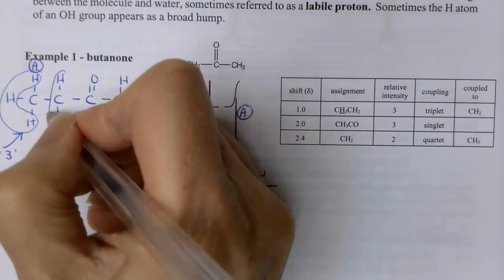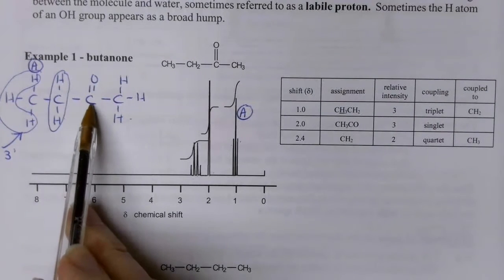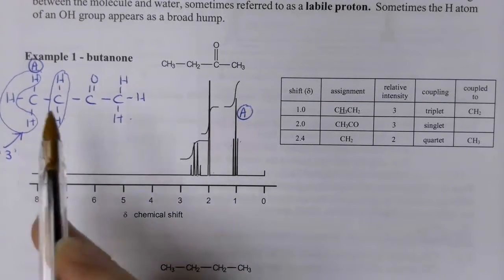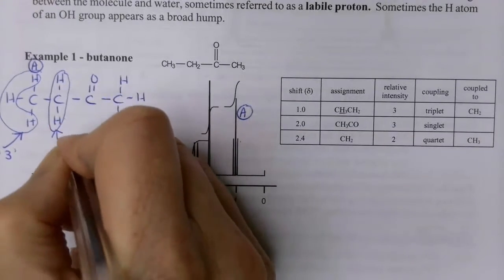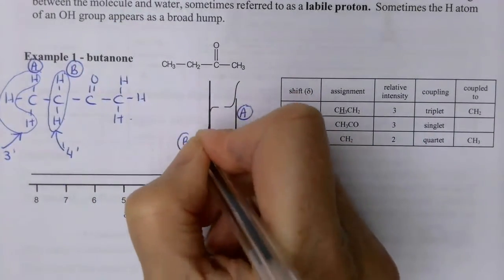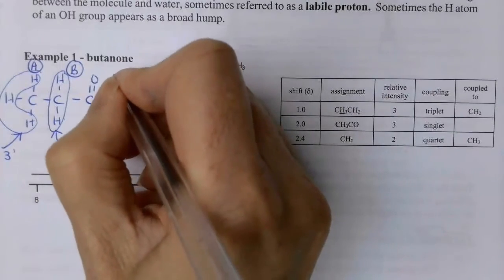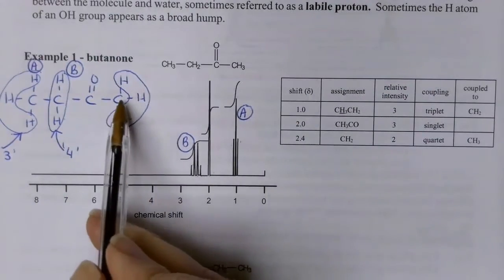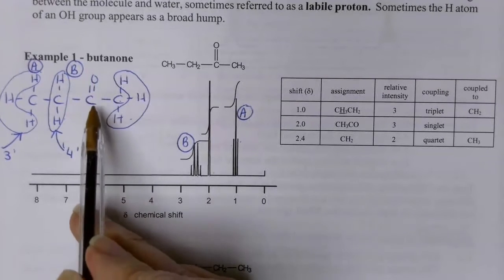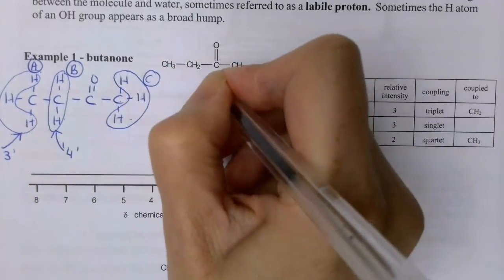Now I'm going to look at these hydrogens here. And again, I'm going to look left and right along my molecule. On this carbon, I have no hydrogens. On this carbon, I have 3 hydrogens. 3 plus 1 for myself, that makes a quartet. So that is 4. So this, which I'm going to call B, is this signal here, because I've got my 1, 2, 3, 4 lines. Last but not least, I've got this CH3 group on the end. And again, if I look at the adjacent carbon, I've got no hydrogens on that one, so that's n plus 1, that would be 1, so that would be a singlet, and that is this group here.